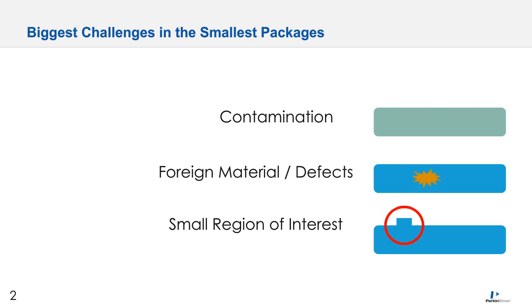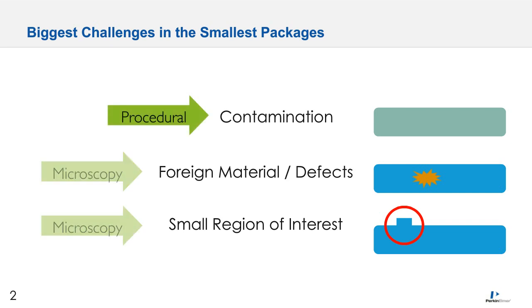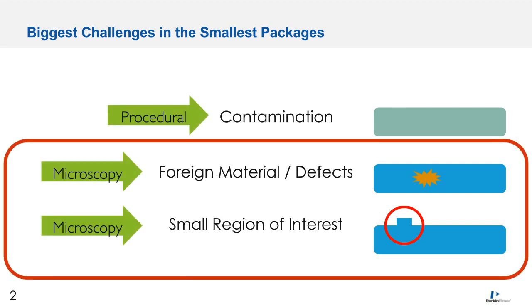And I bring up these three examples here because I would like to draw some distinction: analysis of contaminants in examples where they are actually spread or diluted through a bulk material often requires a different analytical approach, maybe some added sample preparation or chemical workup to isolate that contaminant for analysis. Perhaps it requires analysis with an alternative analytical technique, perhaps chromatography or some other analytical instrument.